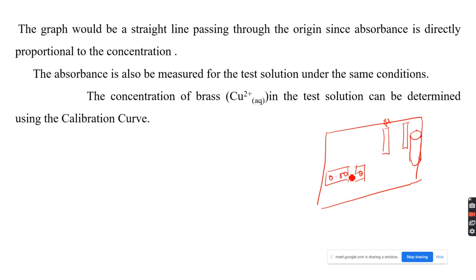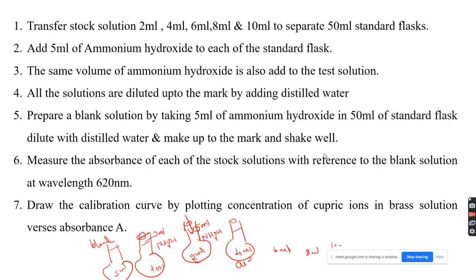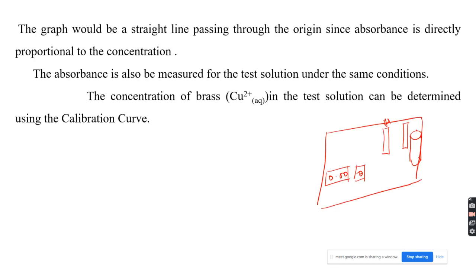Then we'll observe the absorbance of that reading. Say the absorbance for 2 ml may be 0.09.